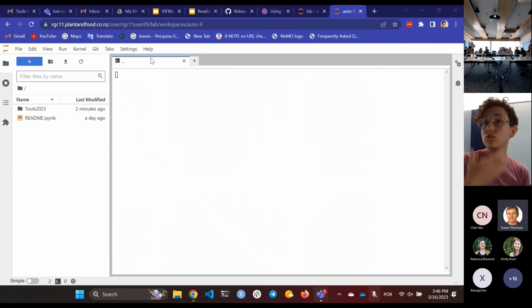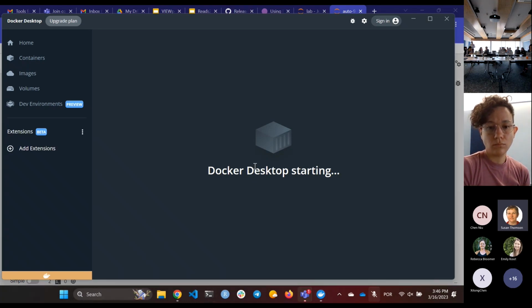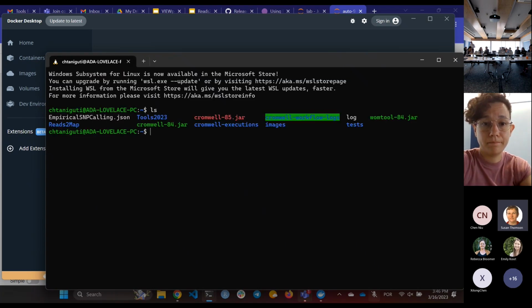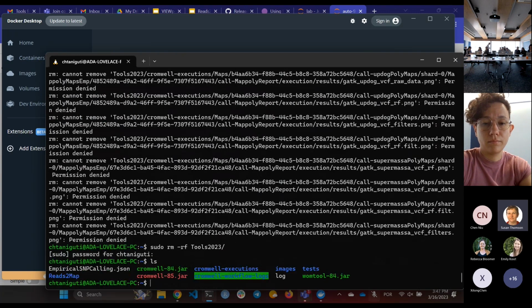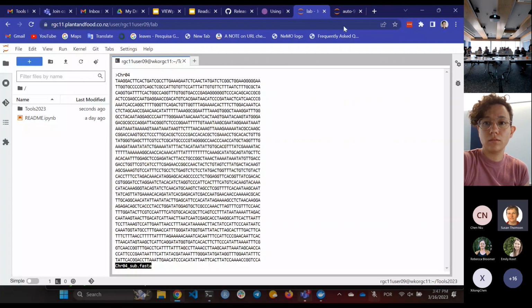I can do my computer, just to keep the code. She doesn't actually have the files on there, but we can send you the information. She's pulling the FASTQ files, so you can just manually type them.